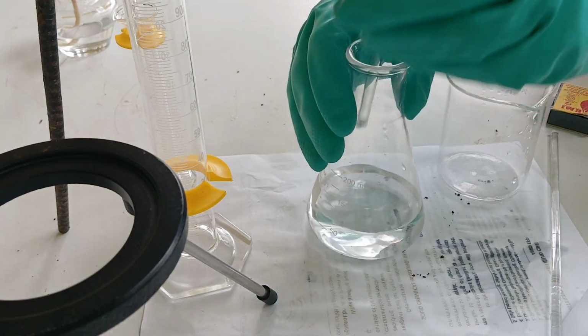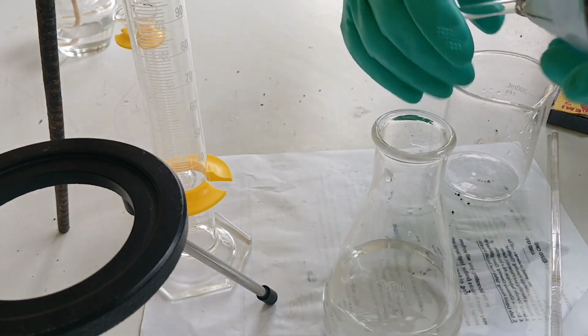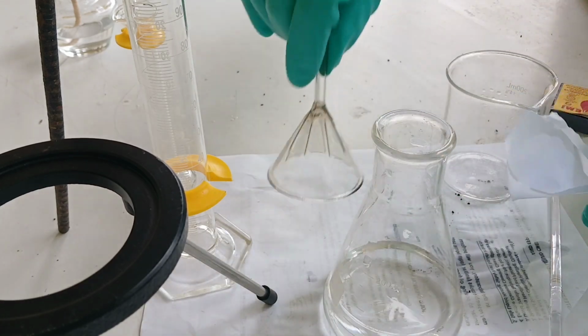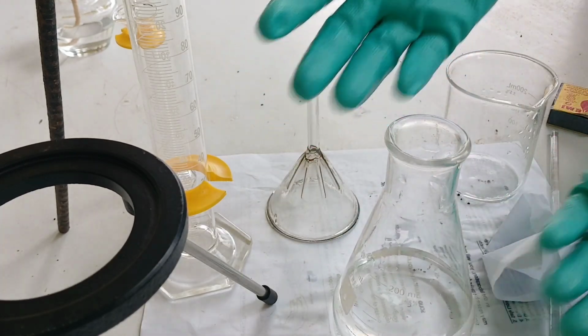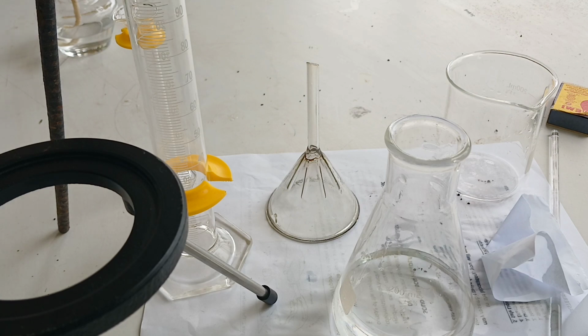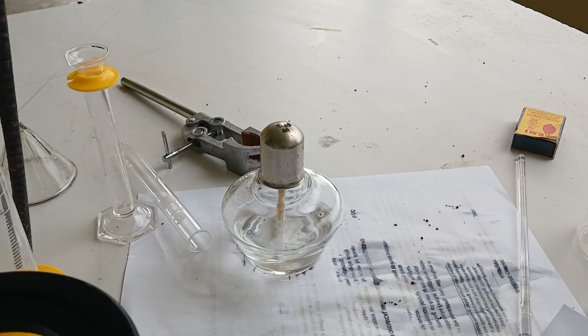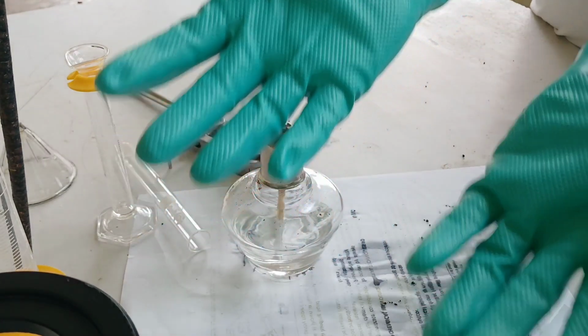If everything is fine, then you remove the filter paper, and that's your supernatant liquid. If there are a lot of particles there, you have to let it dry and gather the particles if you need those solid particles, and on the other hand, the liquid. That's how to transfer liquid chemicals.